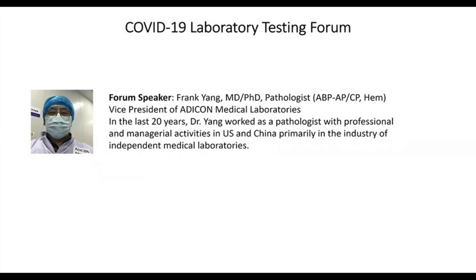Answering this question, I have to say our experience only applies to independent clinical laboratories, which may be different from CDC laboratories and public hospitals. That's probably why we have this session. From last December to late January, samples were handled almost exclusively by CDC. During this time, samples were collected by hospital staff and processed by CDC laboratories or public hospitals.